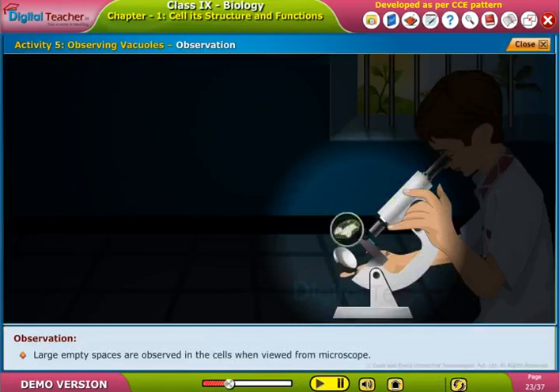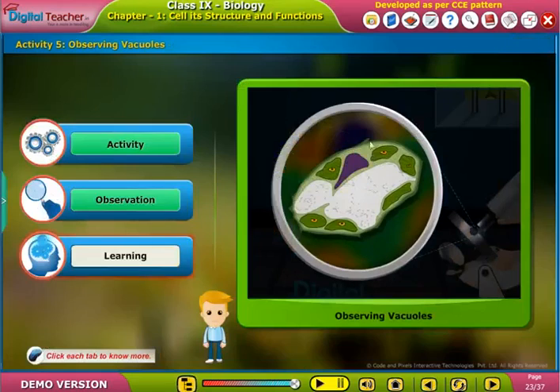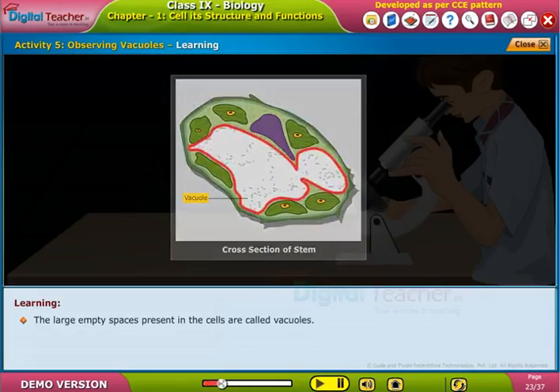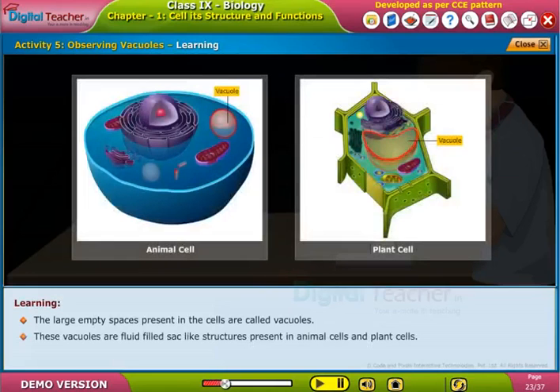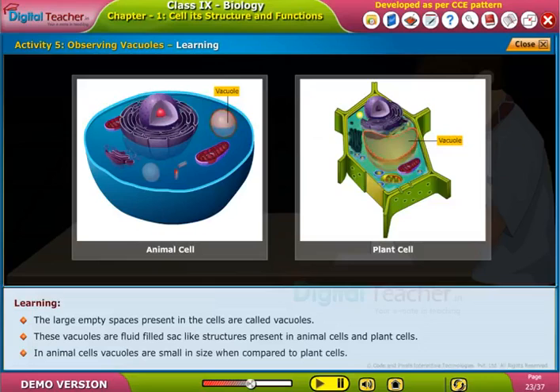Now place the slide under the microscope and observe it under low and high power. Large empty spaces are observed in the cells when viewed from the microscope. These large empty spaces present in the cells are called vacuoles. These vacuoles are fluid-filled, sack-like structures present in both animal cells and plant cells.